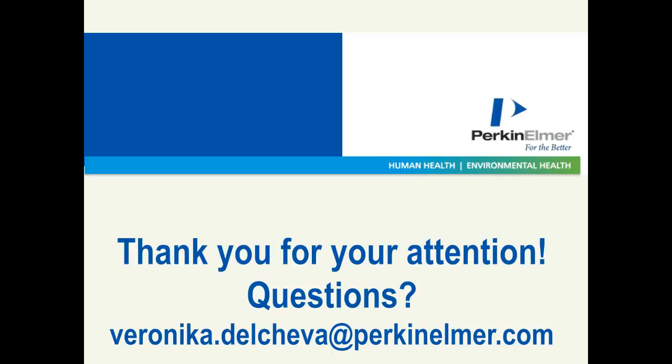So there was a question from Andreas Bress at the ENT clinics in Tübingen, and there was a comment and a question. Basically, the comment was that it was said that the LabChip technology could be used as an alternative to SDS-PAGE, and that you can use reduced and non-reduced buffers. So in theory, it seems that it would be possible to see a gel shift if proteins interact. I'll direct this one to Julius, as Julius's presentation concerned protein analysis. So the question there, Julius, is, is it possible to look at protein-protein interactions by looking at the gel shift with the lab chip technology?